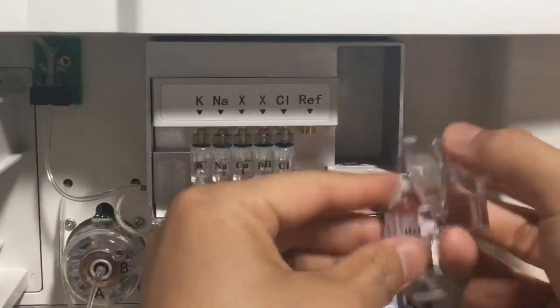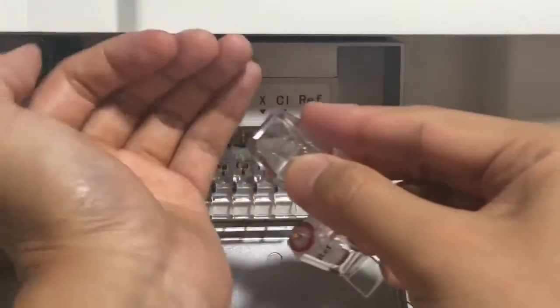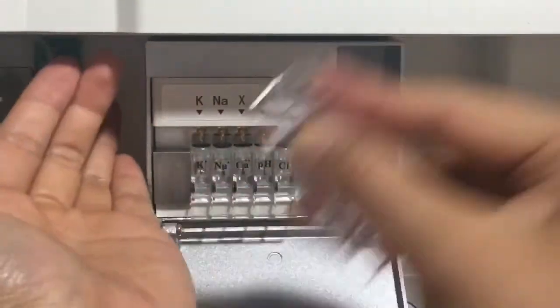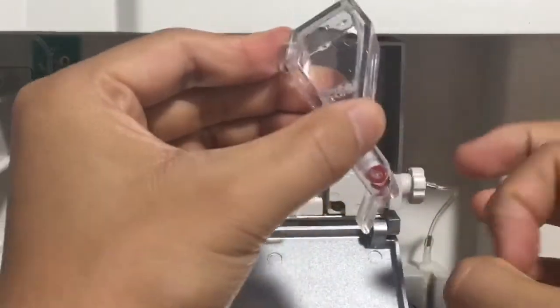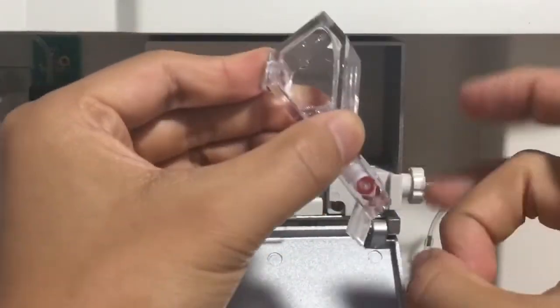For the reference electrode, we need to hold like this and use our palm to hit like this. Then still use the finger to flip the bottom.